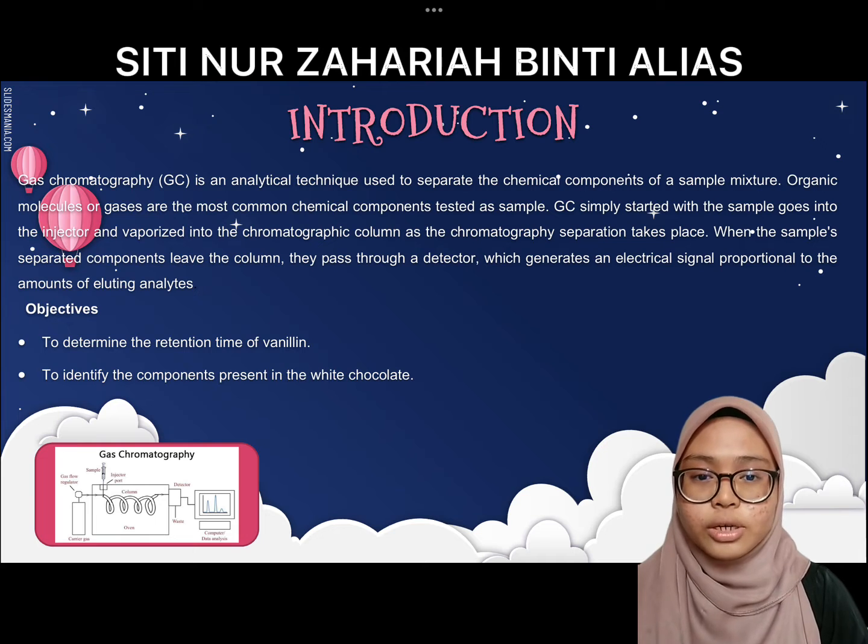Next, we'll move to the objective of this experiment. The objective of this experiment is to determine the retention time of vanillin. The second one is to identify the components present in the white chocolate.